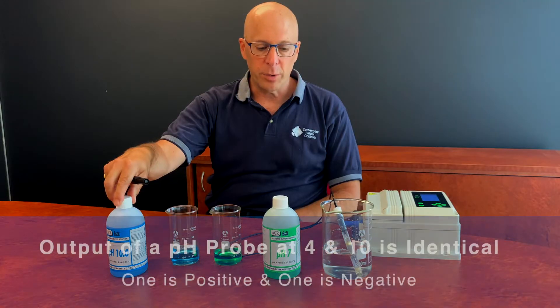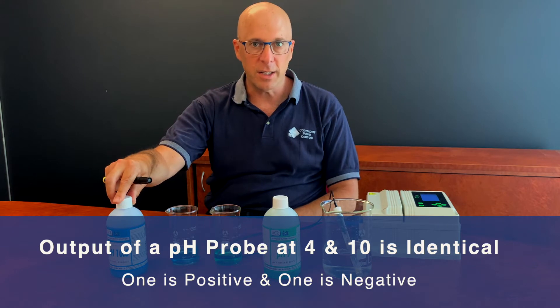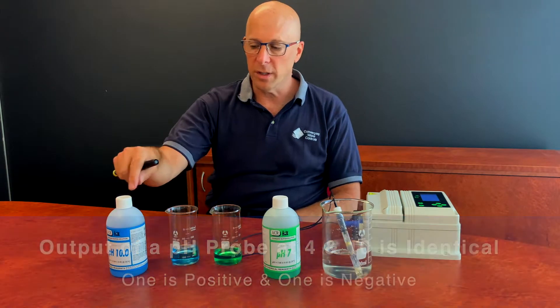The millivolt outputs of a pH probe at pH 10 and pH 4 are identical except one is positive and one is negative. So it doesn't matter which one you use. In this example, I'm going to use the 7 and then a 10.